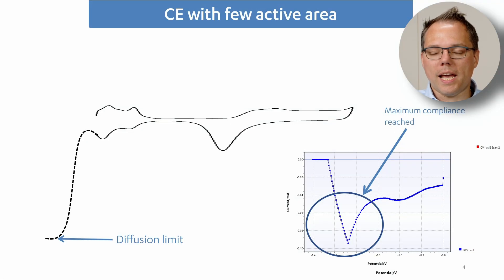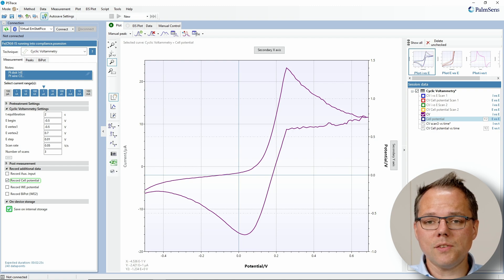Okay, maybe this is a bit abstract. Let's have a quick look at PS trace at a measurement that I did where I ran into the compliance voltage. Okay, so this is my measurement. This is a CV with a suspicious sharp peak here and then some zigzaggy curves.